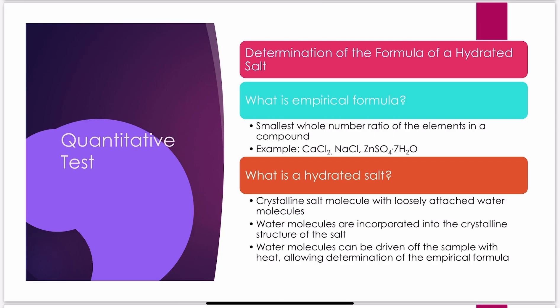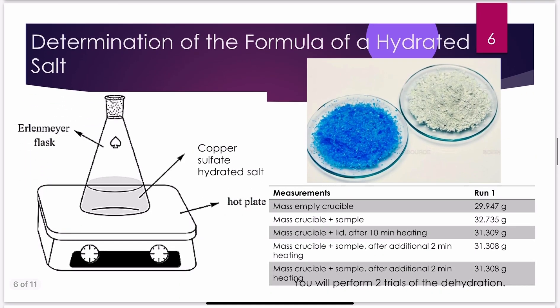A hydrated salt is a crystalline salt molecule with loosely attached water molecules incorporated into the crystal structure. The water molecules can be driven off the sample if we heat it. So today we're going to heat a sample of hydrated copper sulfate on a hot plate and drive off that water. Anhydrous means no water left — this is what the copper sulfate is going to look like as an anhydrous salt.